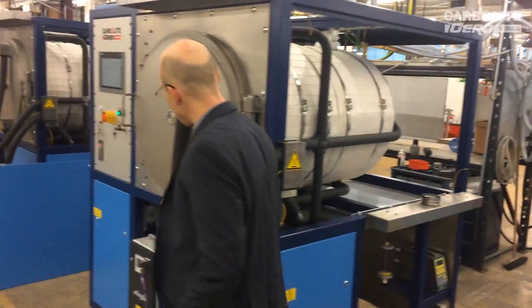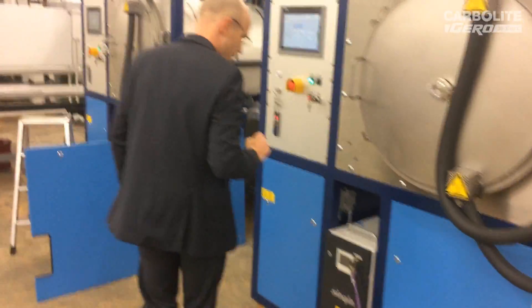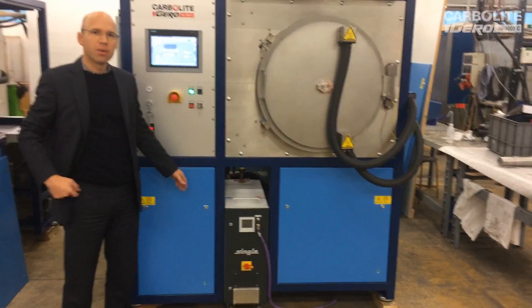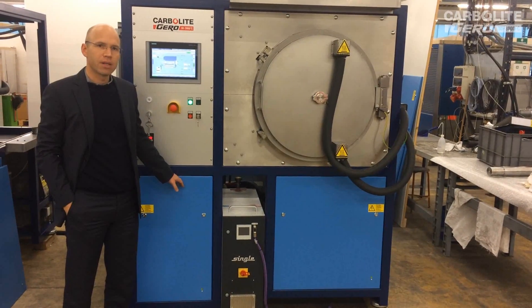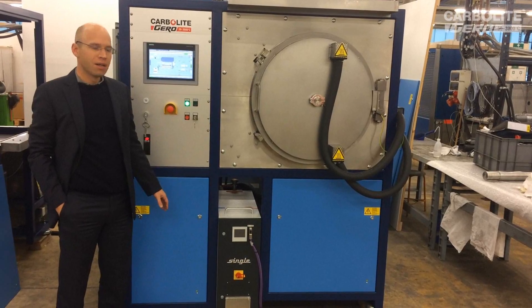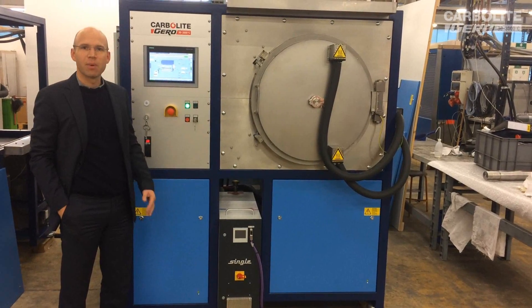Going around the furnace again, we see the color here is blue. We now have for Carbolite Gero the standard grey and red colors, but this customer required the blue color. Of course, color is not the most important thing about the furnace.